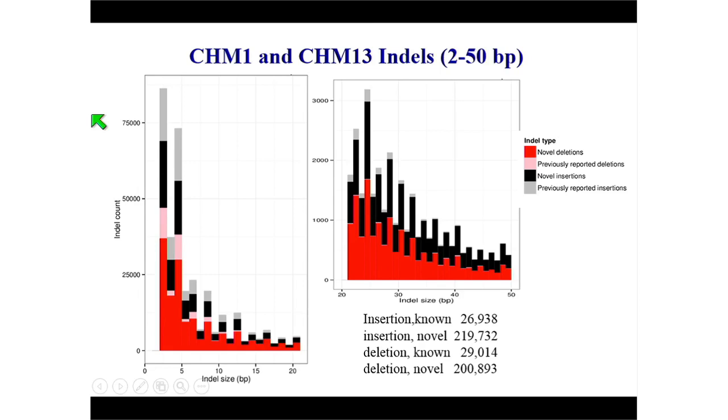And I've purposefully excluded 1 base pair insertion and deletion events, because we know from the technology itself, the most common error that we're getting is insertions and deletions of a single base pair because of missed incorporations. And in fact, we estimate, just based on strict application of PacBio technology and quivering, you have an inflation for 1 base pair events on the order of 2-fold, suggesting artifact based on the technology itself.